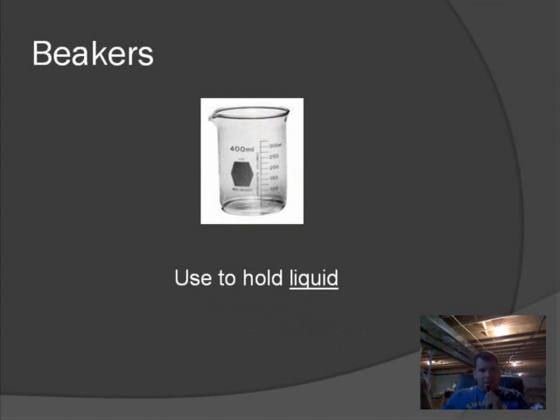The next one is the beaker. It's used mainly for holding liquid, but we can use it for all sorts of different things — you can hold solids in there too. You'll notice the beaker also has measurement lines, but these are not as accurate as the graduated cylinder. They're just approximate — it even says approximately 5% error. That means there's a chance it's 5% off on the volume, so we don't want to use a beaker to measure volume. That's what the graduated cylinder is for.